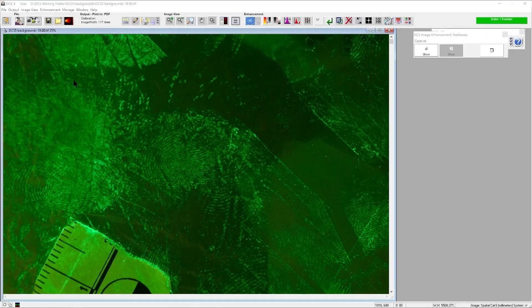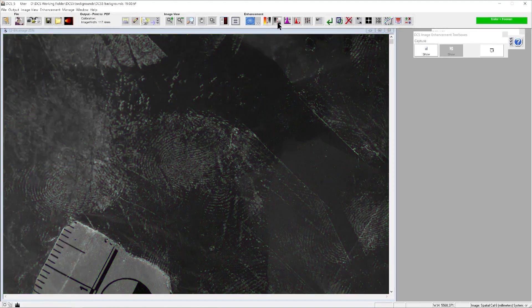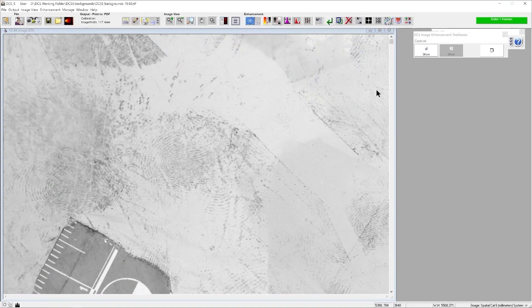So we have the image here in colour. We can simply drop it into greyscale. We can invert it.